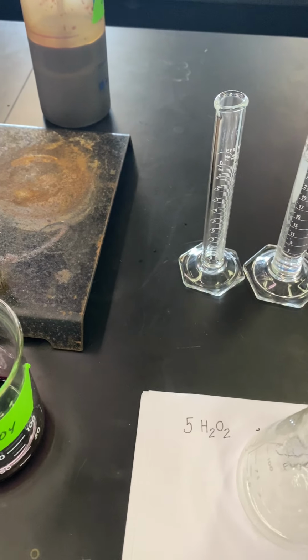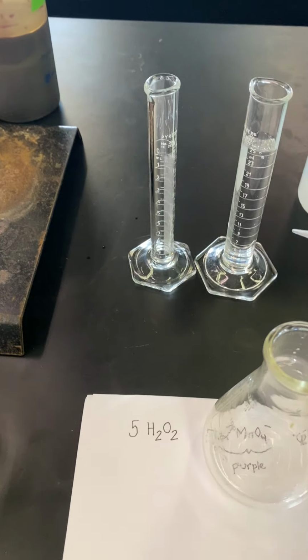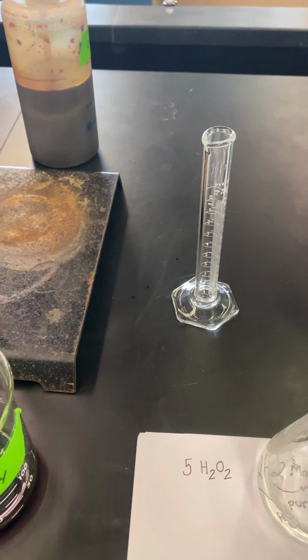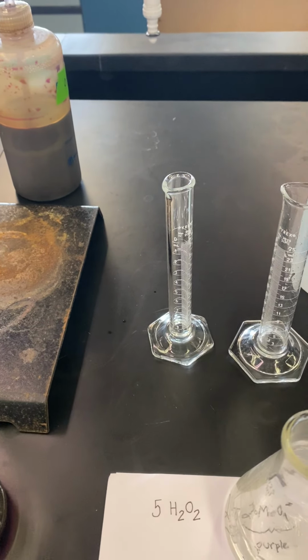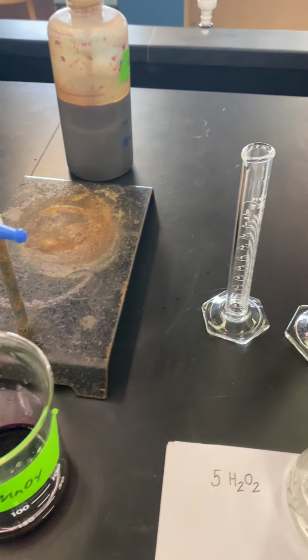It's just there to give you more volume to swirl and facilitate the reaction. So it really does not matter that I'm above the 25. So I'm just going to pour that right into my hydrogen peroxide solution. I am A-okay with that. And I'm not even going to record that in my data sheet because, like I said, it has nothing to do with the reaction. Okay.